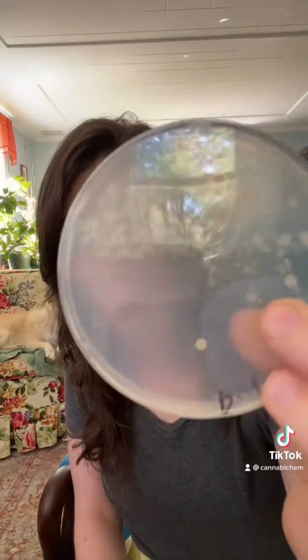I used distilled water for this experiment and honestly I thought this experiment was going to run for like a week before I saw any substantial growth. But to my surprise, after only 24 hours we have bacterial growth. So what does this mean? It means change the water in your piece every single day, clean it often, and send this video to someone who needs to clean their piece.